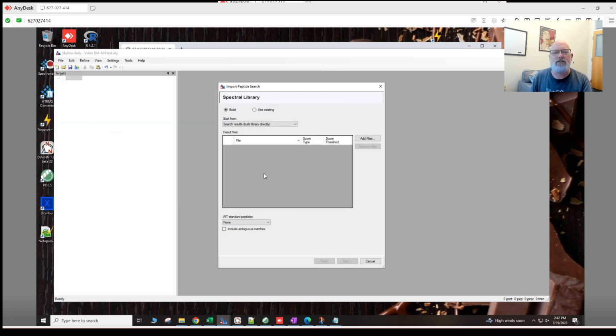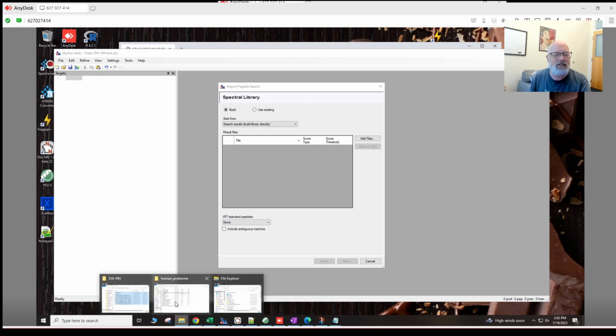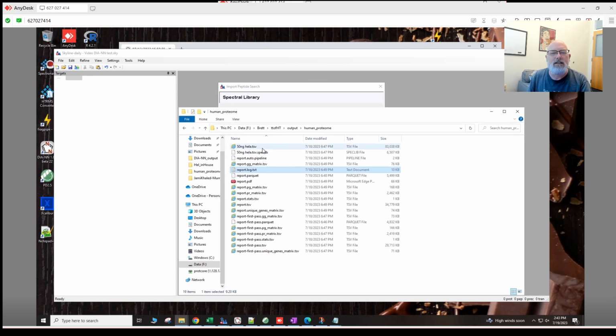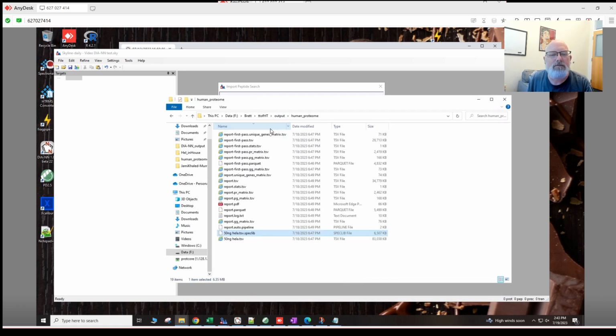All right, so for the spectral library, we're going to build the spectral library. This is where you're going to run into trouble, and I had to ask support how to do this. But once you get it down, it's super easy. You're going to want to feed it this HeLa 50 nanogram TSV speclib file. But if you sort by name, let's see, did I do this today?